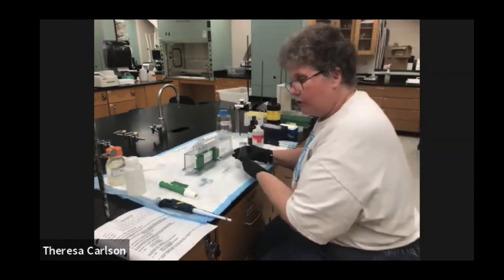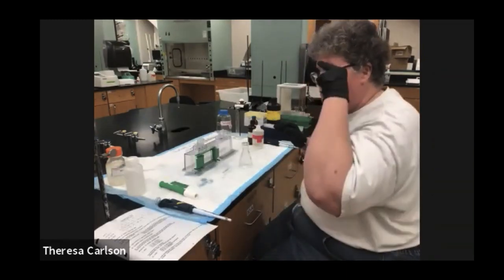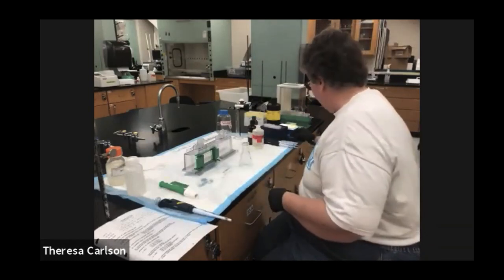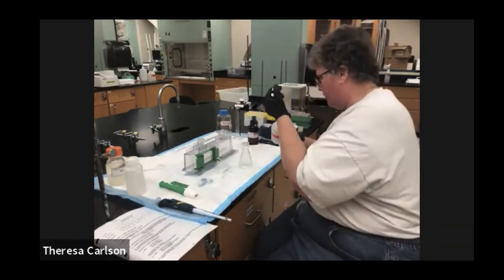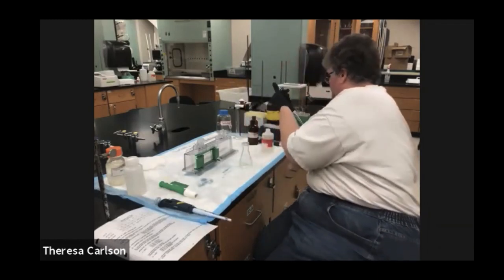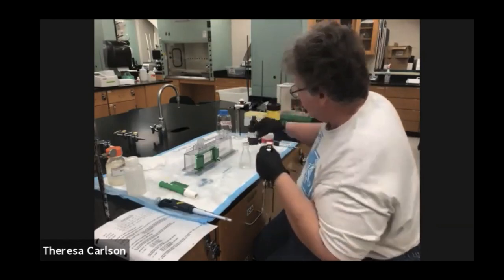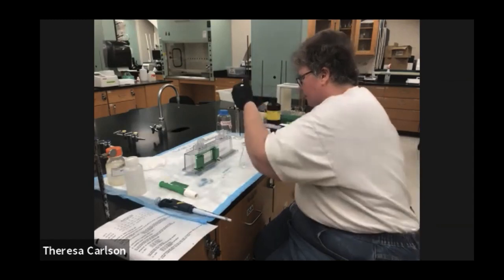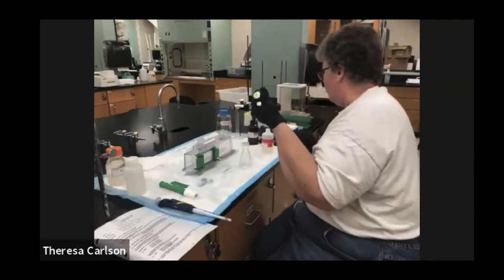Here I have my solution that I've already made that contains 1.3 mLs of solution A, 2.5 mLs of solution C, and 6 mLs of water. And now I'm going to add 100 microliters of my 10% SDS. I'm adding 100 microliters of APS. And then I'm adding 10 microliters of TEMED.